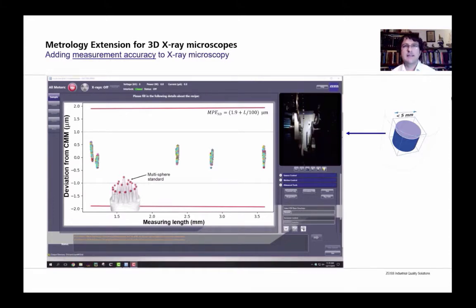Of course, if the data deviations lie below 1.9 microns, which was the case here, the system is well calibrated and the system is ready to be used for measuring samples in the prefixed work space of the 5 millimeter field of view. The user can basically put the sample inside of the machine and perform the scans to obtain the 3D volume voxel data after reconstruction. Dimensional measurements can then be performed based on such voxel data, knowing with enough confidence that such measurements will be accurate.